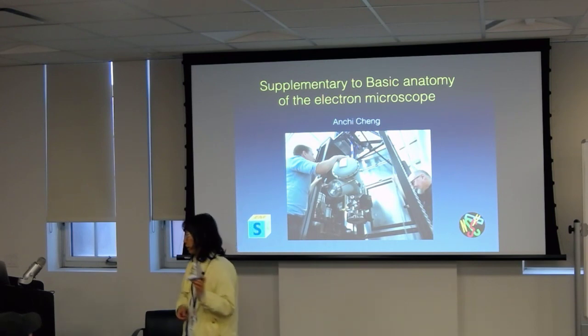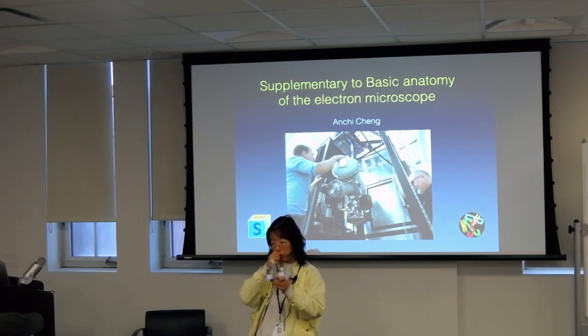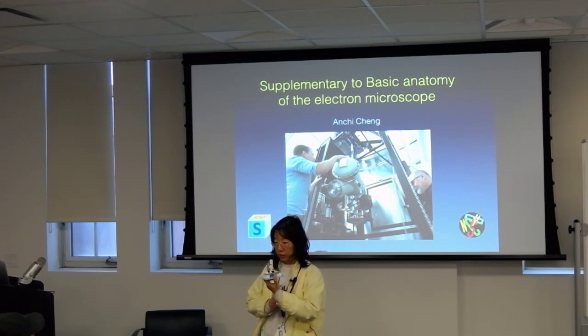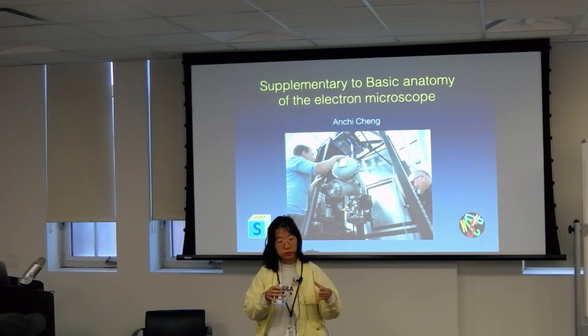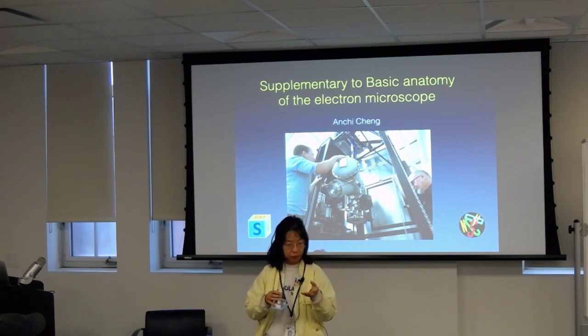Okay, now a lot of the microscopes that you're going to see, when you go to your facility or when you use here, are going to start not looking like this. Now the reason for that is stability. You get better stability by enclosing this whole inside something. So you can have doors that close it up into a box. And you're going to see the microscope at the 200 kV level. Most of the ones that you see at the 200 kV level, they have a box.